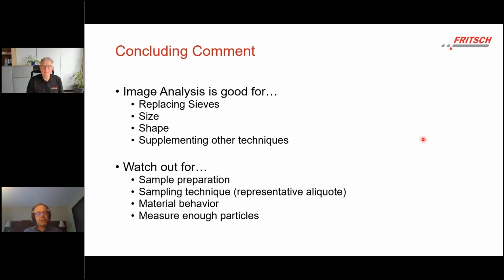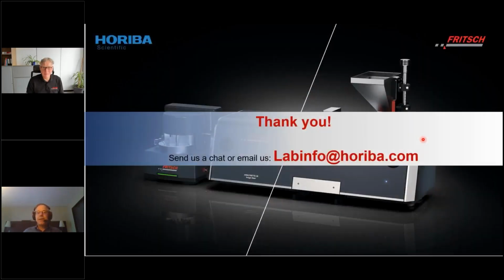And on that last point, because image analysis is slower compared to the ensemble techniques, it's a question that comes up, and dynamic image analysis in A28 is a way to overwhelm that question by using a statistical sledgehammer. I'm going to say thank you here, and I'll leave this slide up in case I need slides for questions. I'll turn the question and answer period over to Julie.